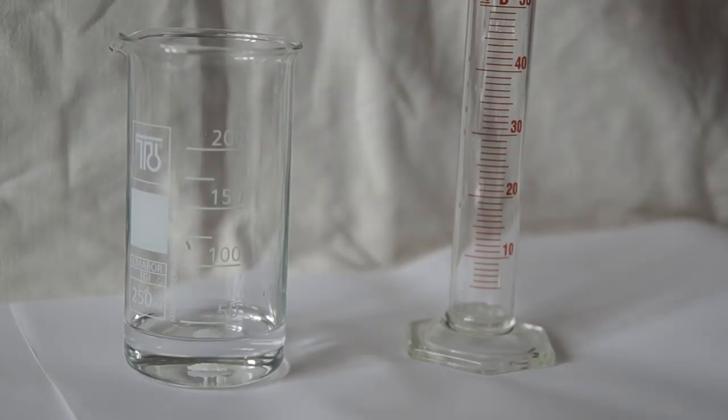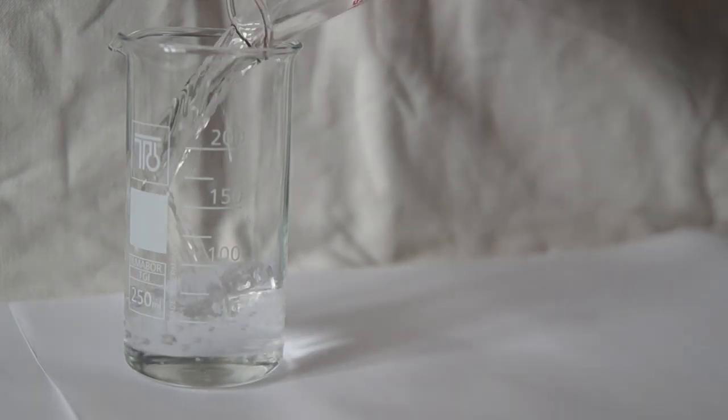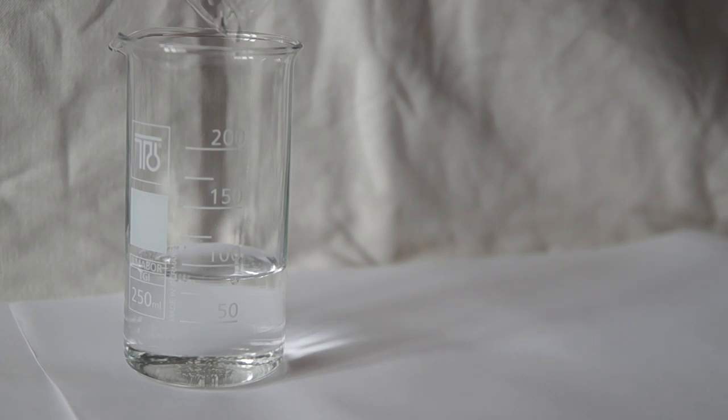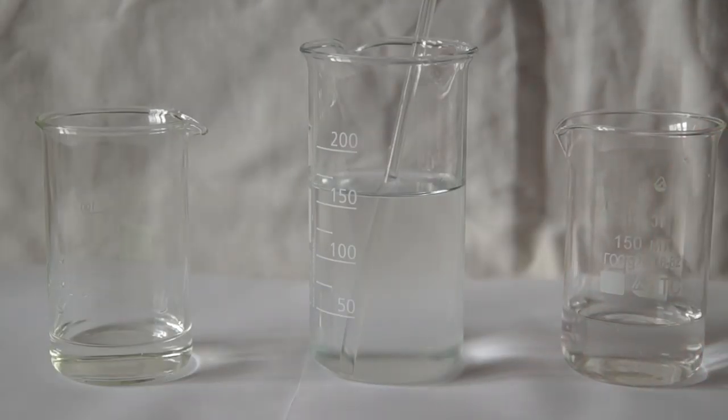Now in the second beaker which is filled with potassium iodate solution add another 120 ml of distilled water. It is also acceptable to spread that volume of water into all three beakers. Now we can conduct the experiment.